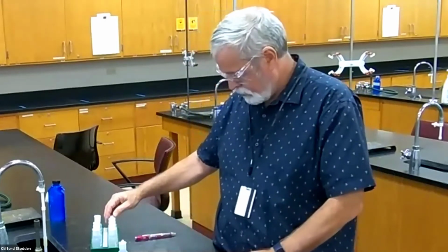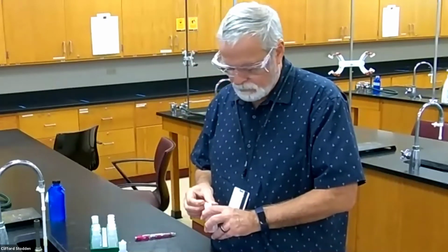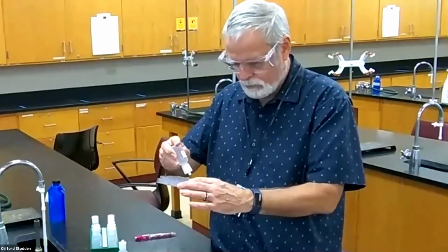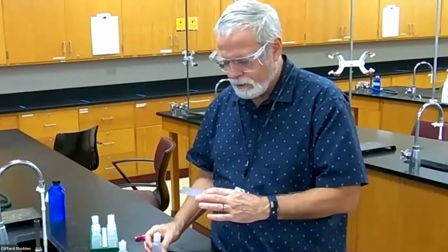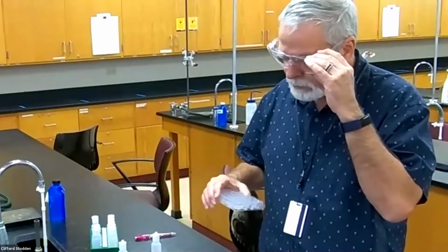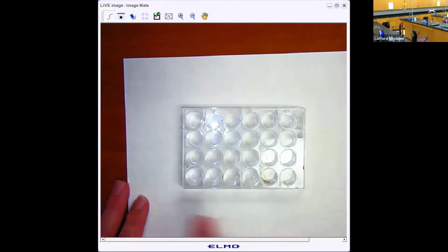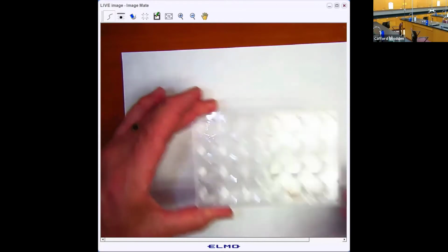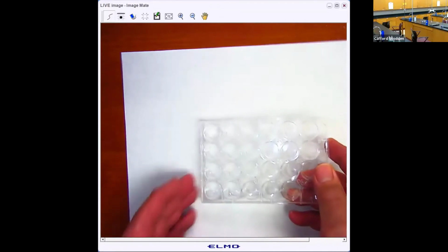And then I'm going over here and looking for the barium chloride. Not the same number of drops of barium chloride, and I cannot tell that there's anything there. It's not turning cloudy, so I would conclude that that's no reaction. I'm going to carry it over here to my first solution right there, and you can see that there's nothing. It's just completely clear. There's no cloudiness at all, so that's no reaction.